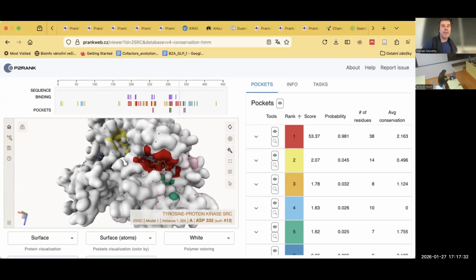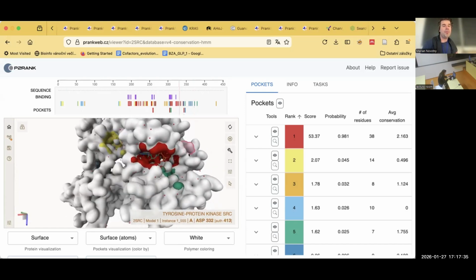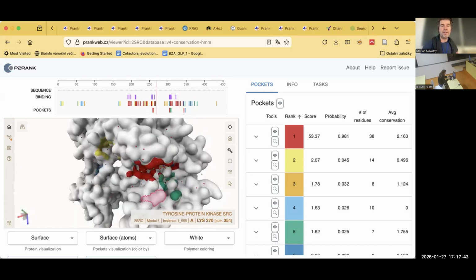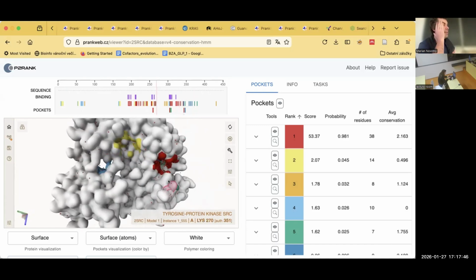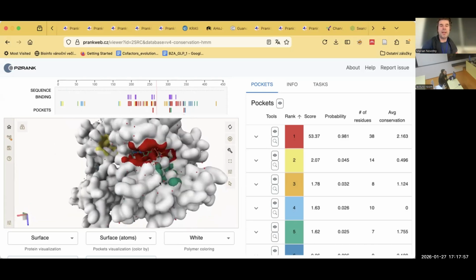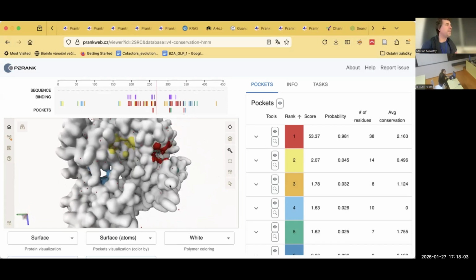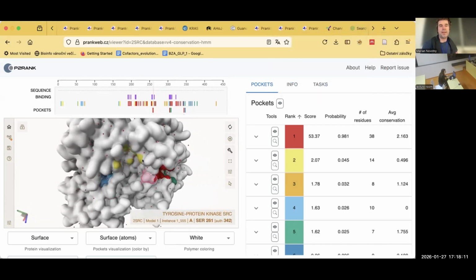available data. But at the moment, what you can do with P2Rank is that you have other sites which are identified and you can try them. Although in this particular case, I think it's more like these CDKs, right, which have the allosteric site. Do you know the protein which has it? Because at the moment, I would say I wouldn't spend much time with other sites identified here. I have no suggestions, just from the general knowledge.